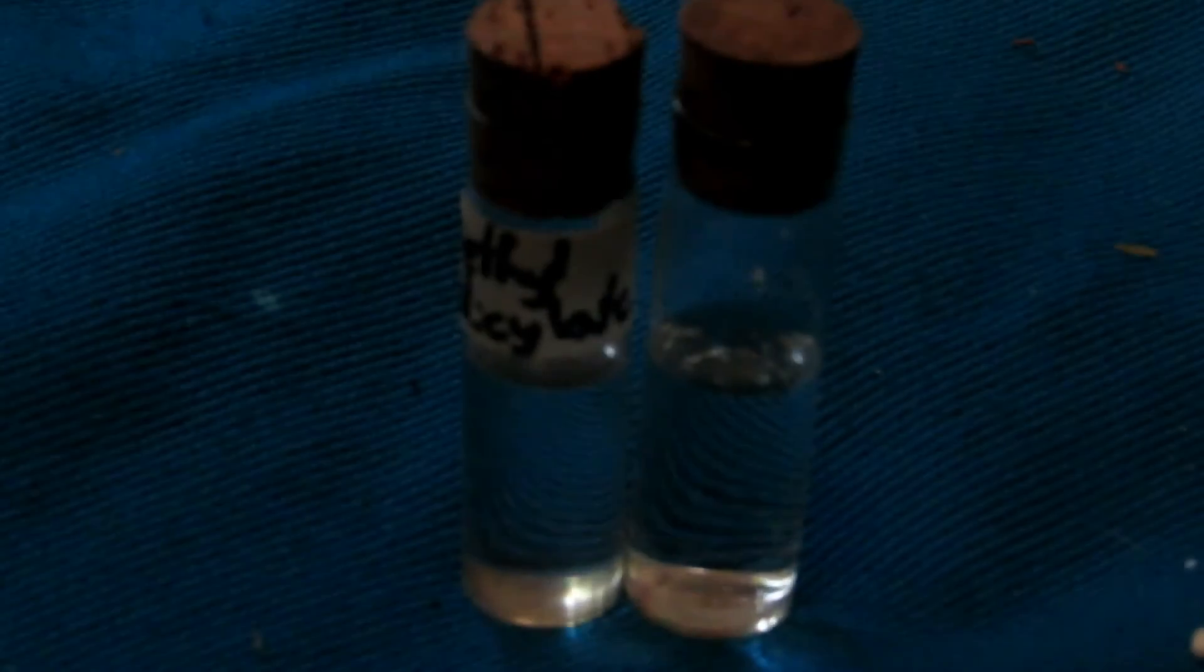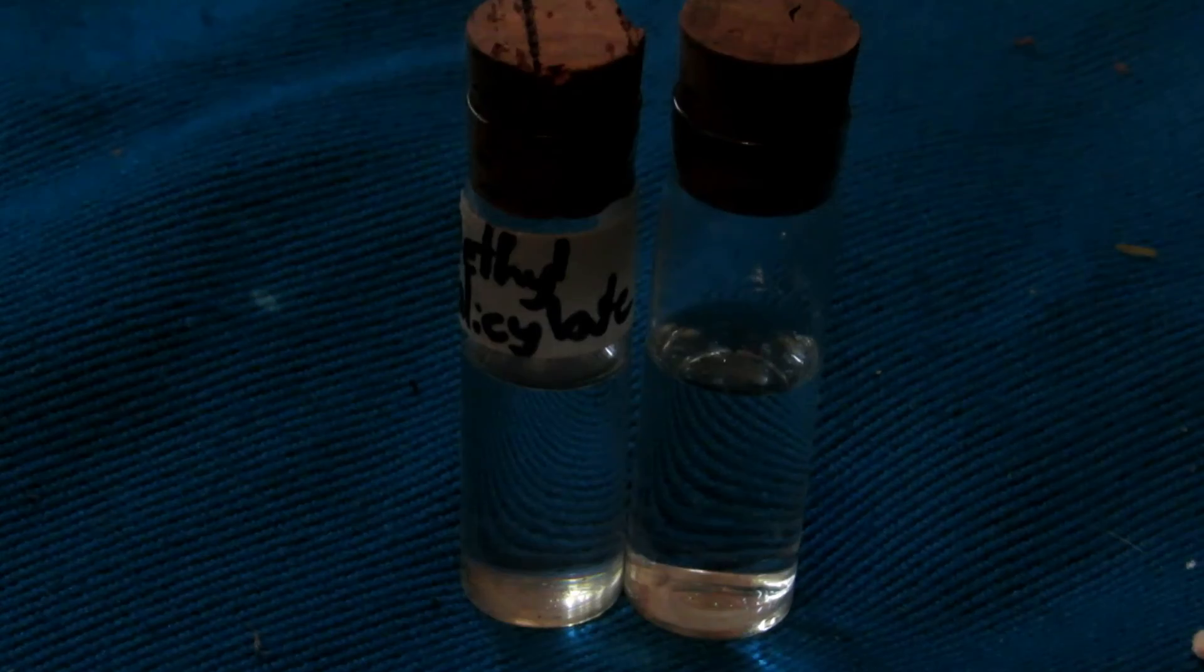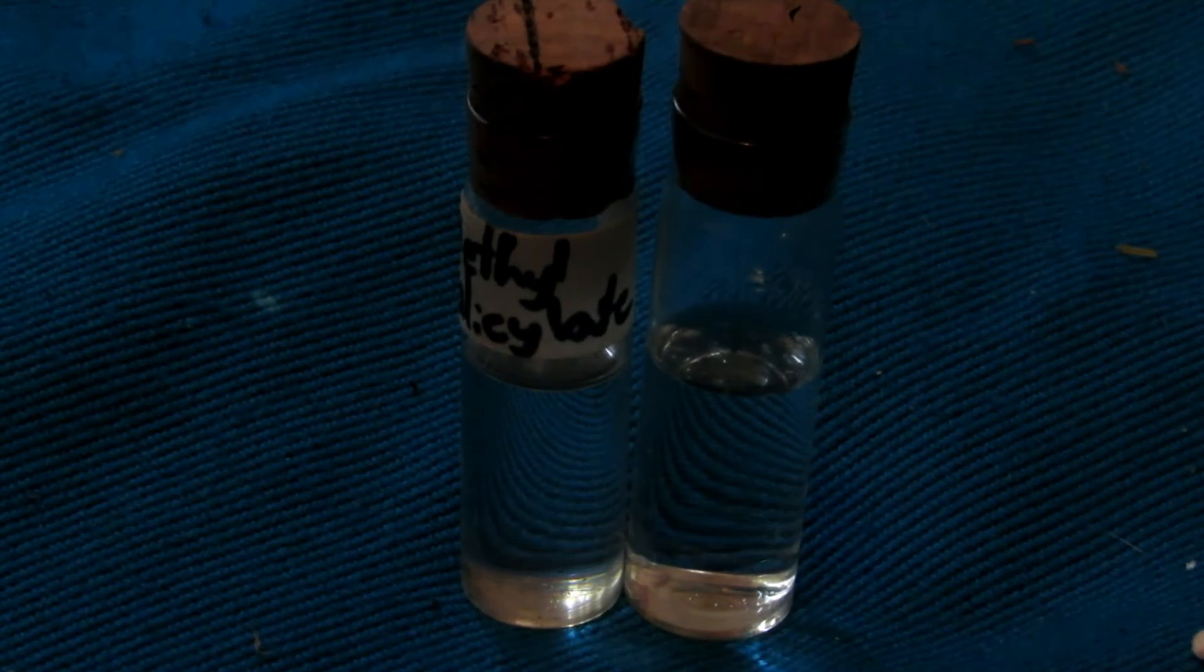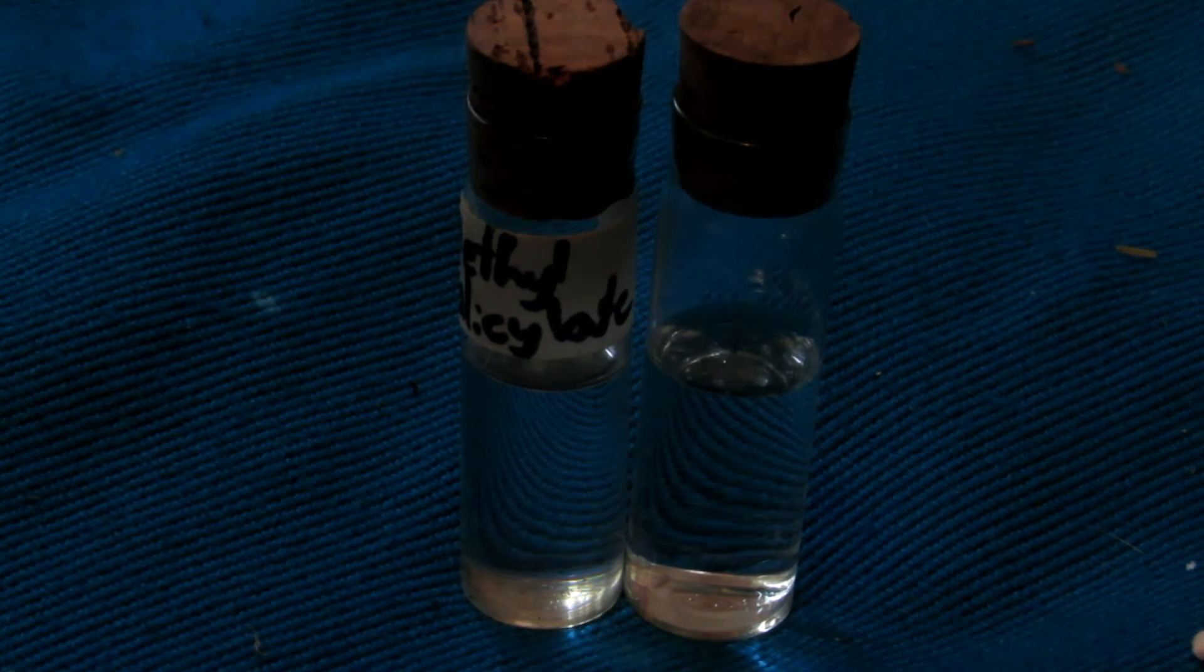That's basically how to make methyl salicylate from salicylic acid, methanol, and sulfuric acid as a catalyst. Remember, methyl salicylate is quite toxic—as little as 5 milliliters can kill a full-grown adult. Don't ingest it, but it smells nice, with an almost minty odor that's not typical mint.